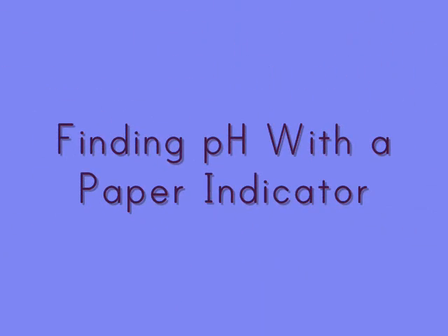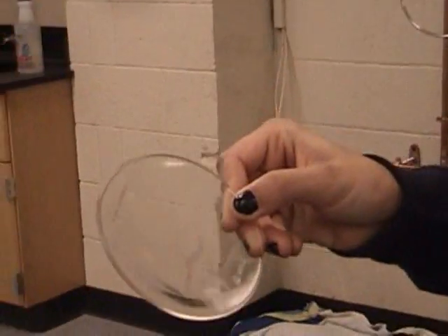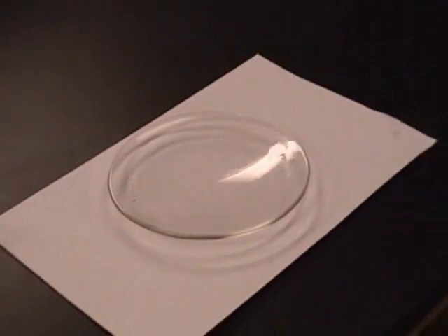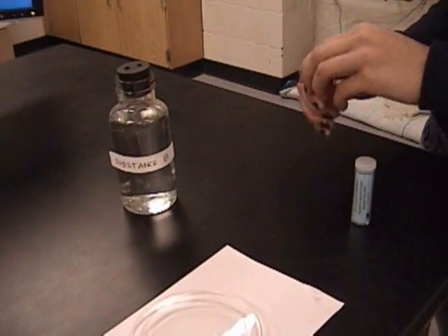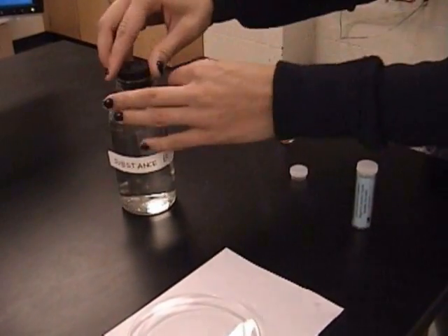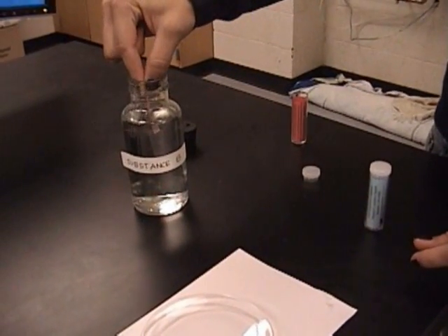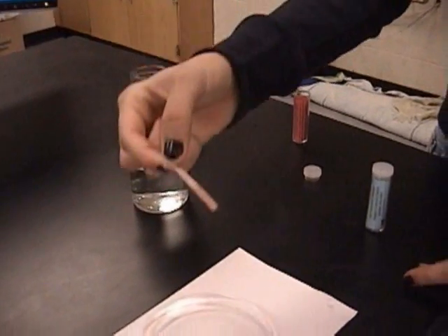Finding pH with a paper indicator. First, place a white piece of paper on the lab table. Place a clean watch glass on the white paper. Dip a piece of red litmus paper about halfway into the substance to be tested. Lay the litmus paper on the watch glass. Observe and record the color change if there is any.